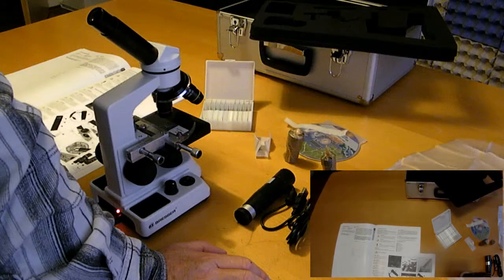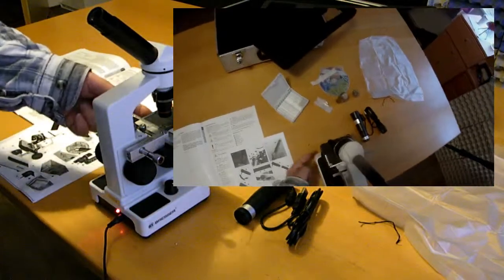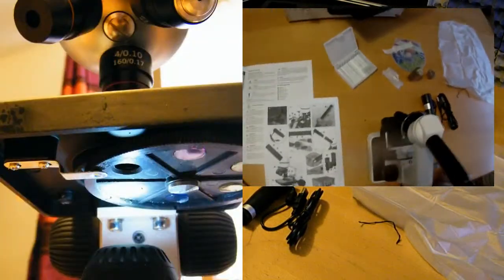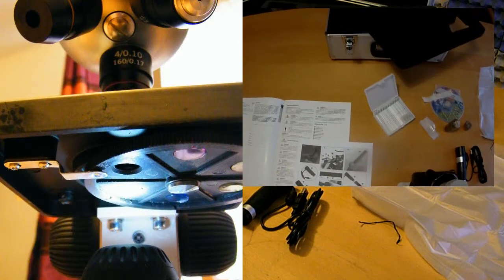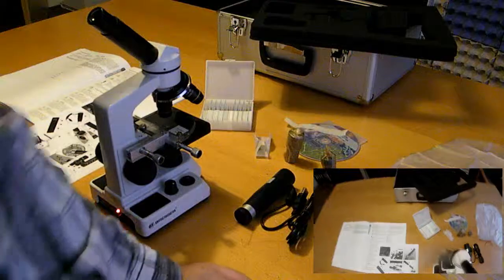The next thing is the filter wheel. It's here at the side. With this camera you can't see it, it's here on that side. It's a wheel, and you can change the color of the filter for different contrasts. And then we have electrical illumination, of course. It's down here. You see it here, the small cap.